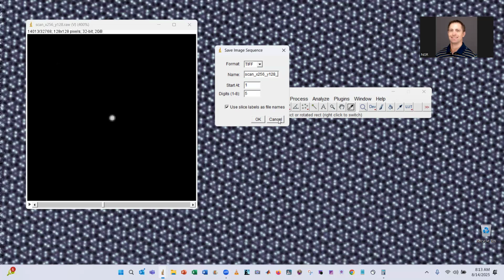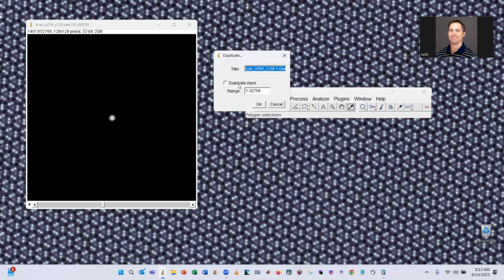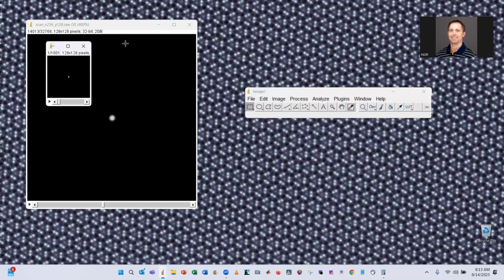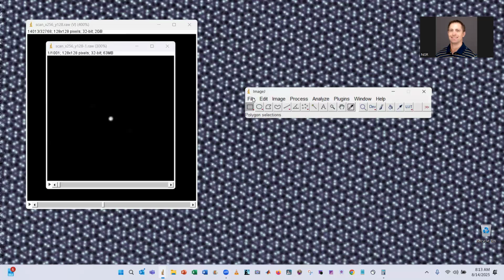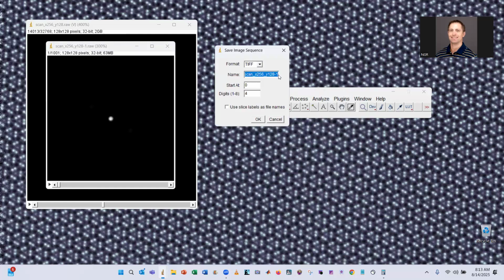So actually, let me create a subset of this to show this rather than do all 33,000 of these. If I do image duplicate, let's just do 1,000 of these, or 1,001, I should say, 5,000 to 6,000. Okay, and then save as image sequence. Okay, and now we only need 4 digits.